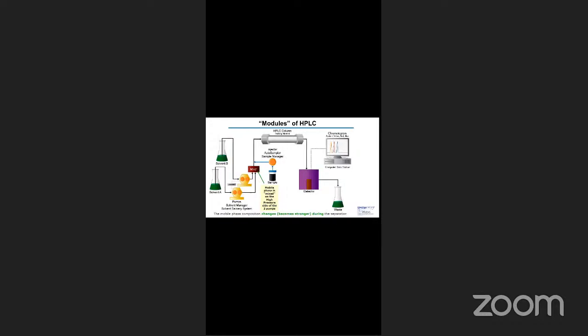Now, if you go into the details of HPLC, the reason we want to do HPLC is separation. If we cannot separate a molecule, then we cannot isolate it, because in a mixture form, the compounds are mostly useless unless you separate them. And I would not say all compounds are useless in a mixture form. I will say most of the compounds are useless in a mixture form. Why? Because you will not be able to make use of it for something that we want.